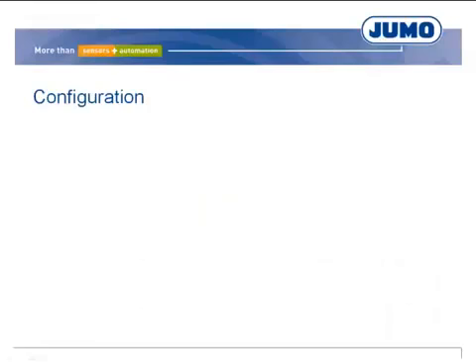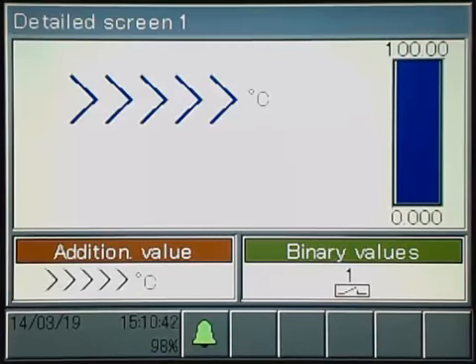It is advisable to use the configuration program to configure the JUMO Aquis Touch S. Only a small number of changes are required to adapt the input for redox potential or pH measurement. The settings are therefore configured from the front of the device. Per default, log on takes place via the user master and the password 9200.